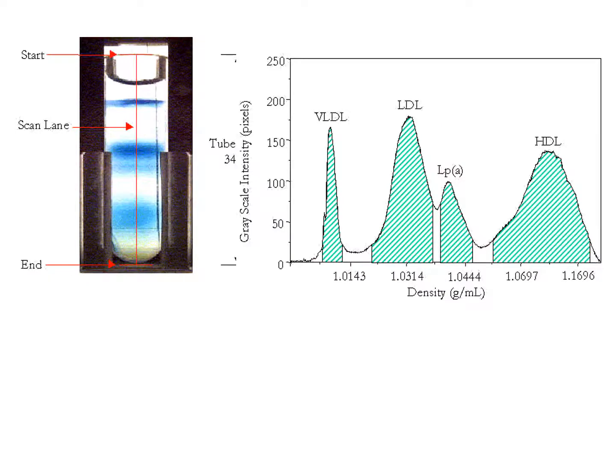This is our lipids, the LDL, the HDL, the good lipid, the bad lipid. So when they take a sample and do a lipid test, they could spin it.